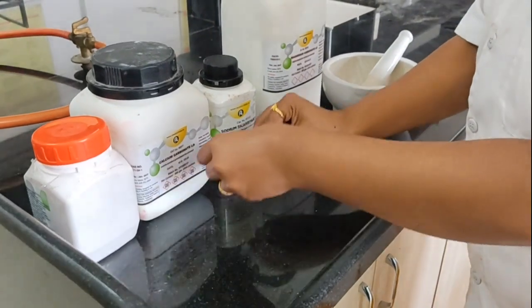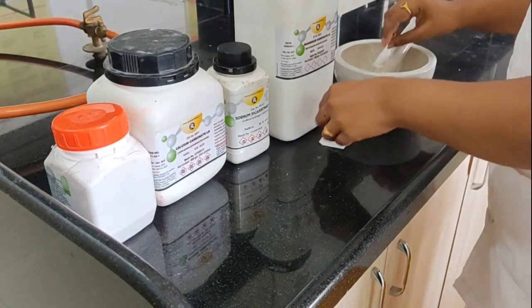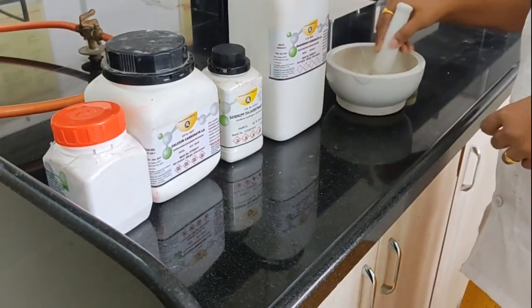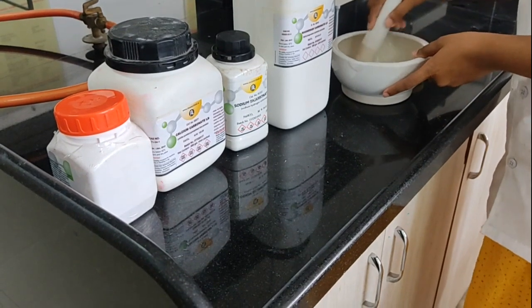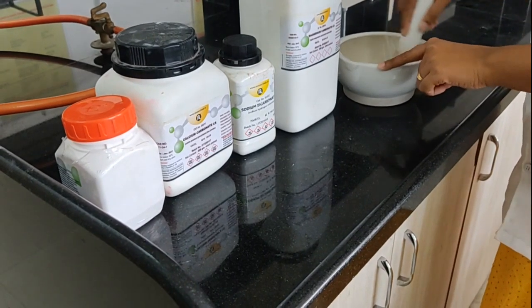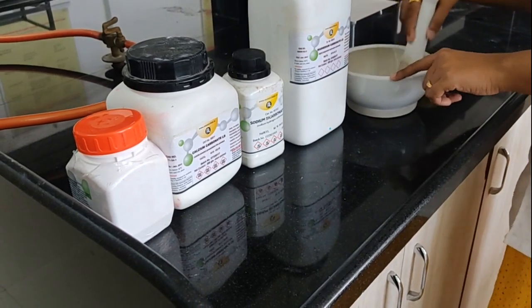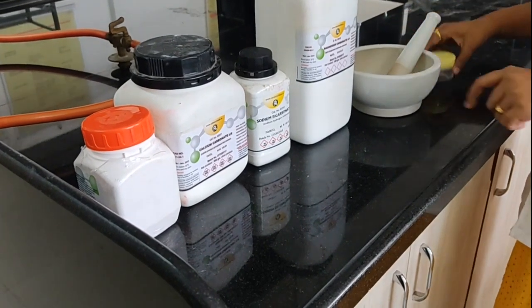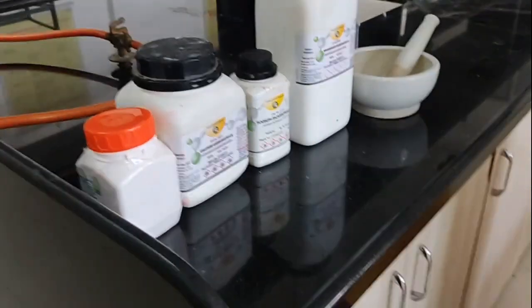So all these 4 powders are transferred into this mortar and pestle for proper mixing. I am going to triturate it properly till all the powders get properly mixed, and after proper trituration of all these 4 powders, now I am going to transfer this powder into this wide mouth dry bottle, and then we will proceed to the next labeling part.